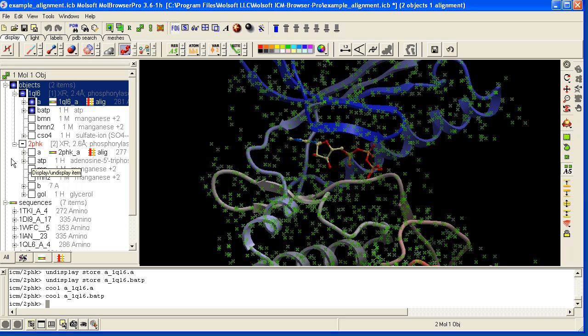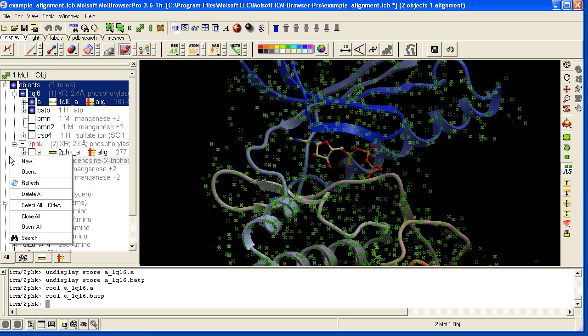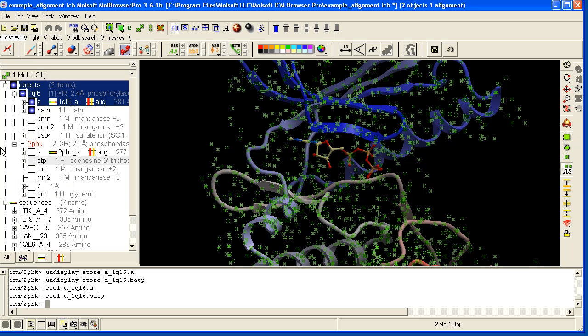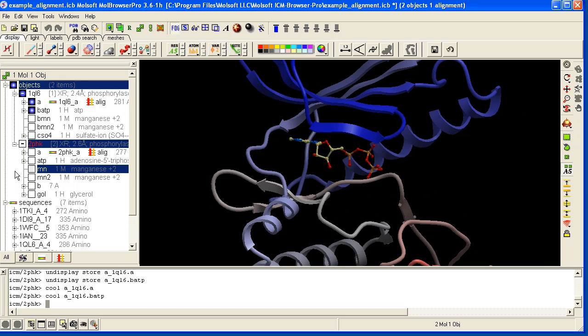You can also remove selections by clicking in the white space of the ICM workspace, here.